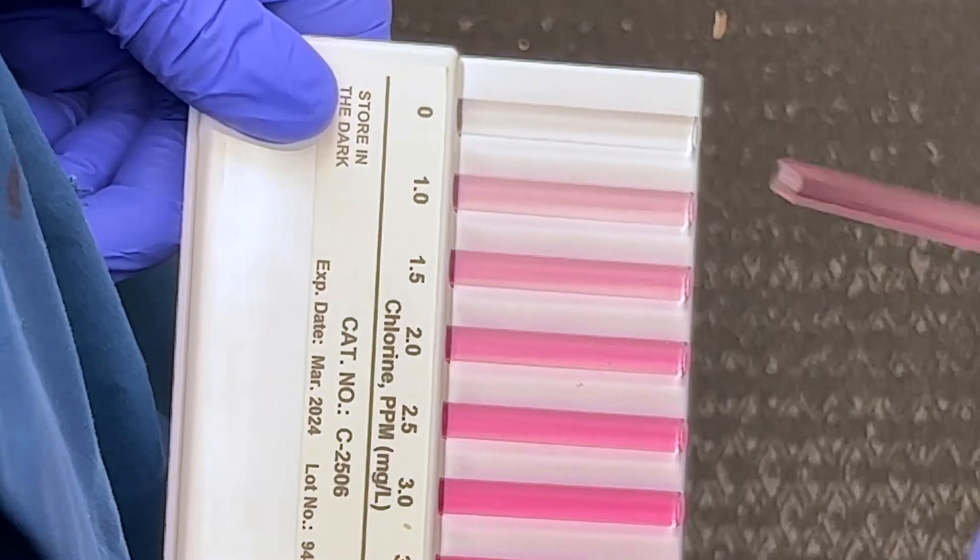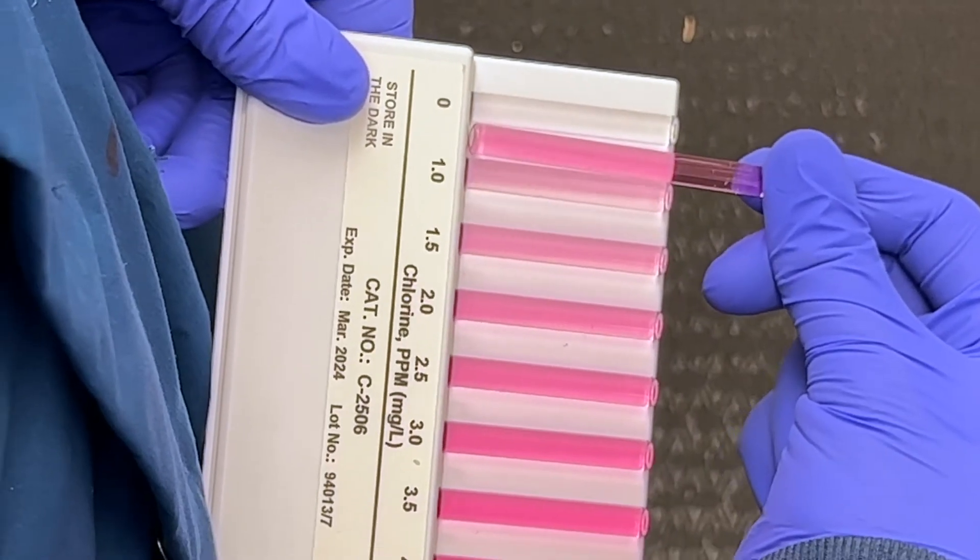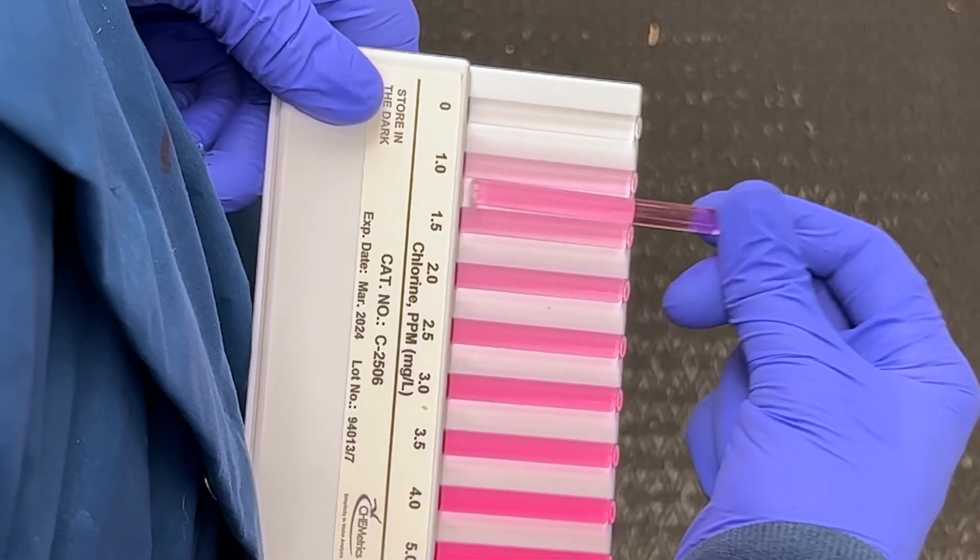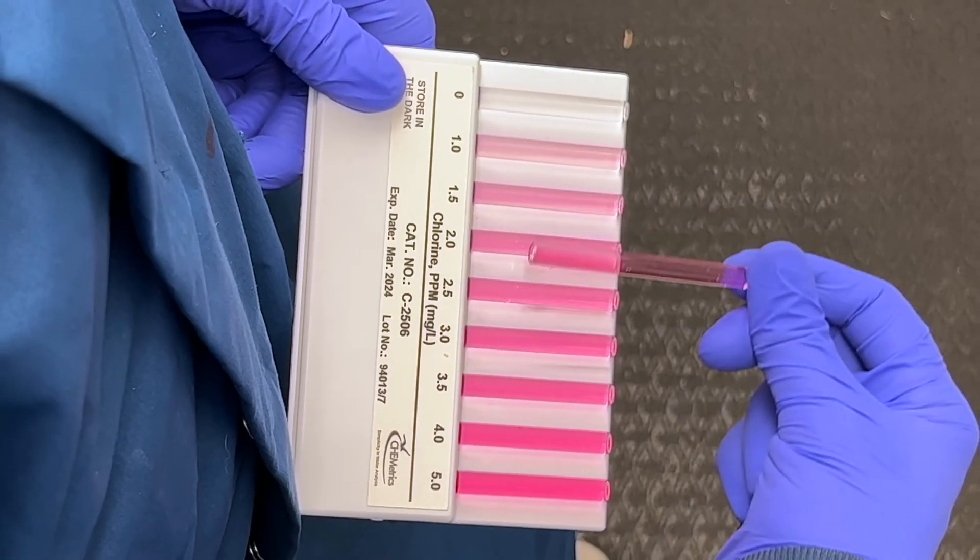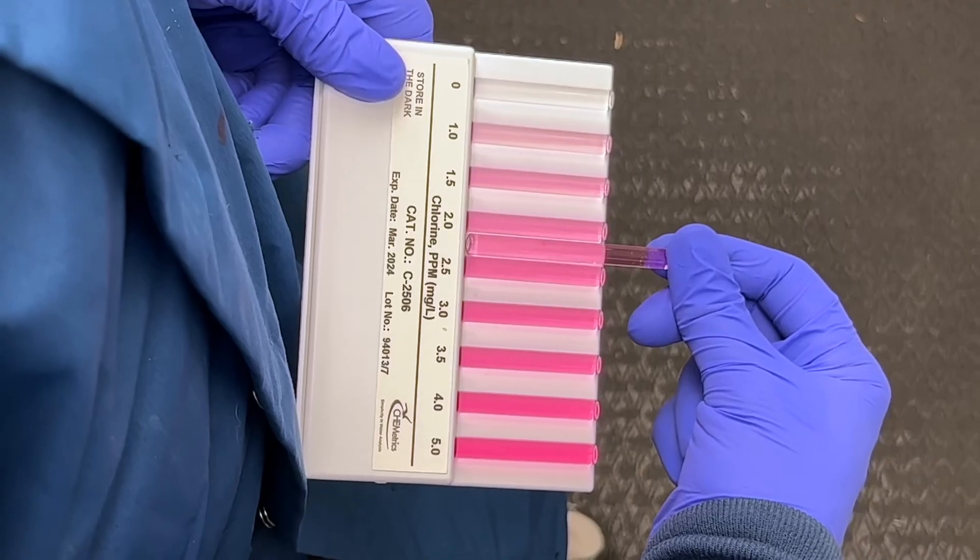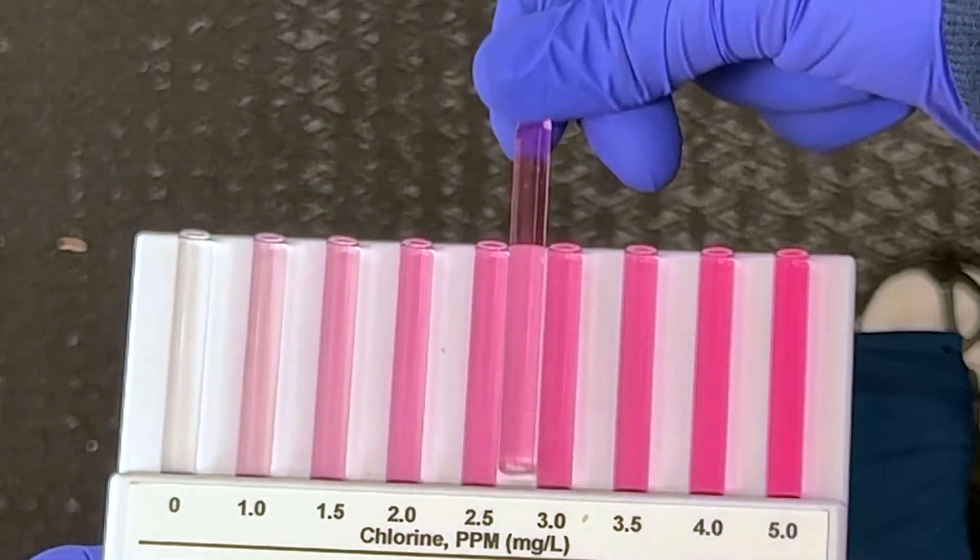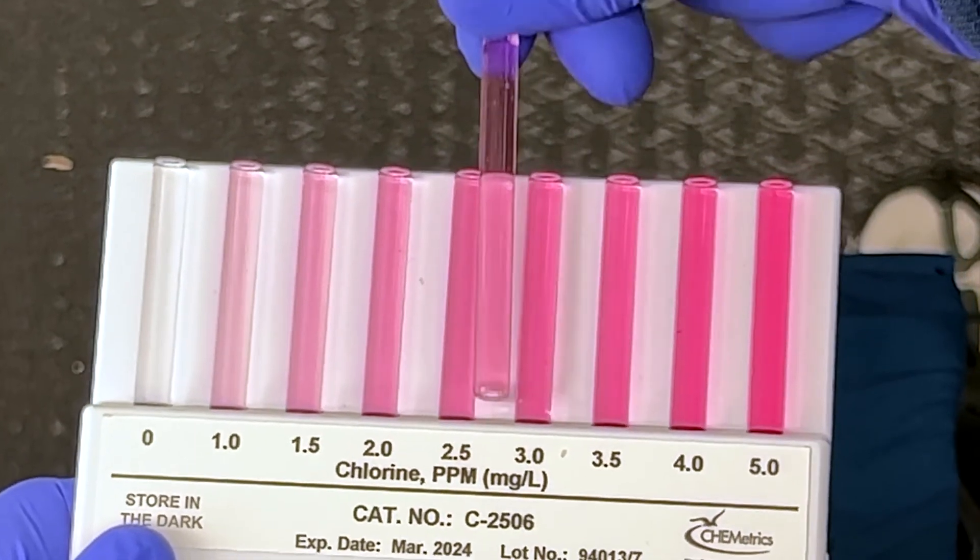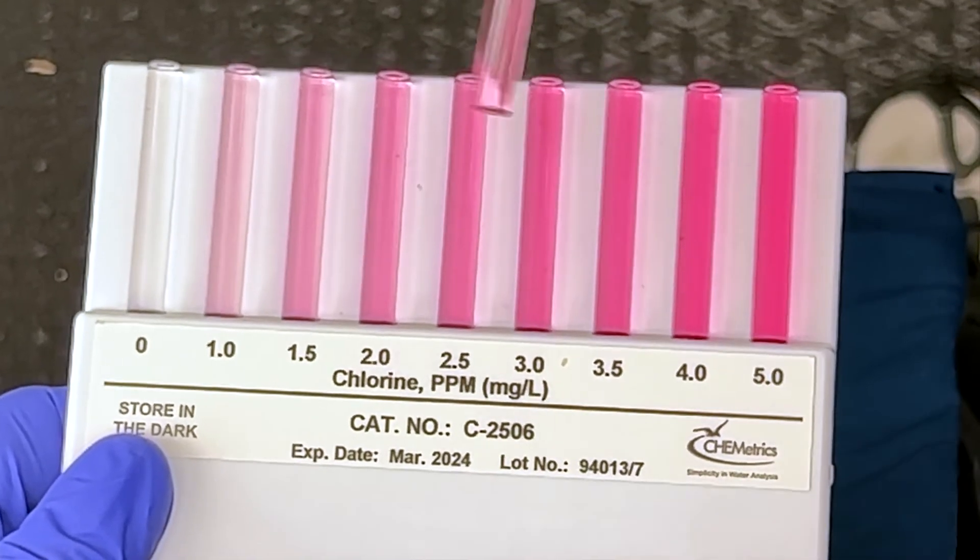Next, the test ampoule should be placed between the first and second color standards at the left or lower concentration end of the comparator. Progressively move the ampoule to the right until the intensity of the test ampoule appears to be in between two nearly matching standards. Alternately move the test ampoule to the right and left as subtle changes in the viewing angle can make the test ampoule look more or less intense than an adjacent standard.